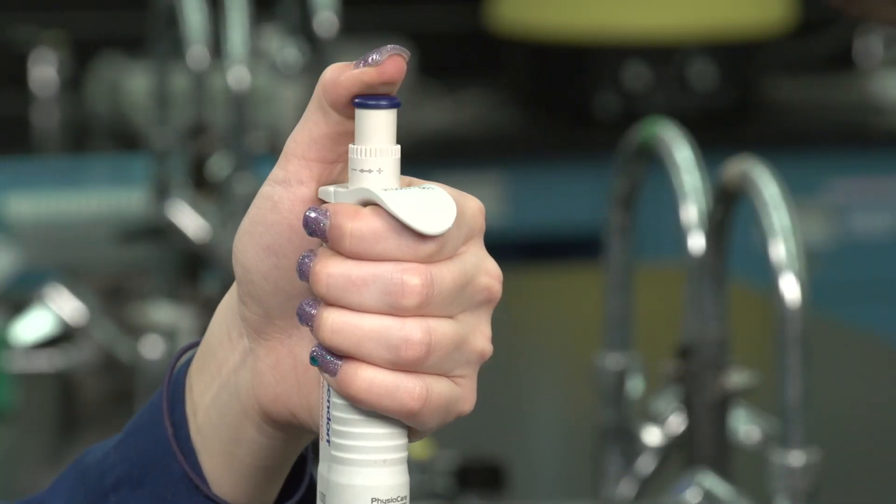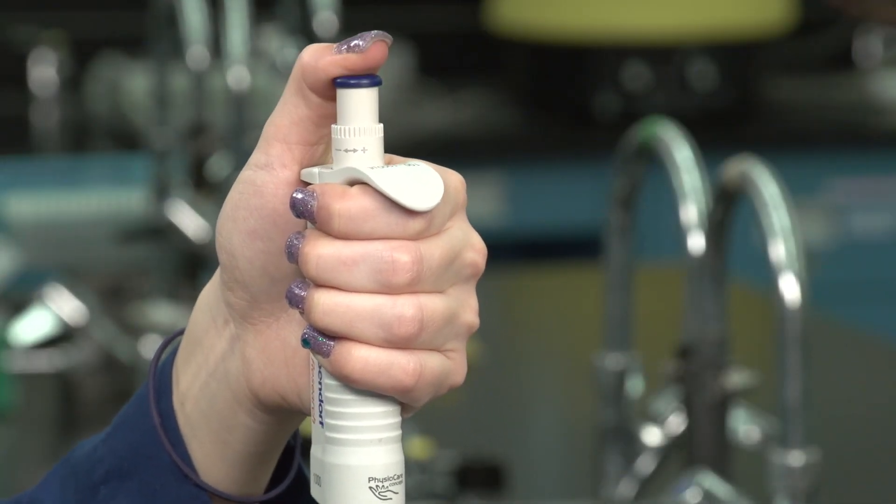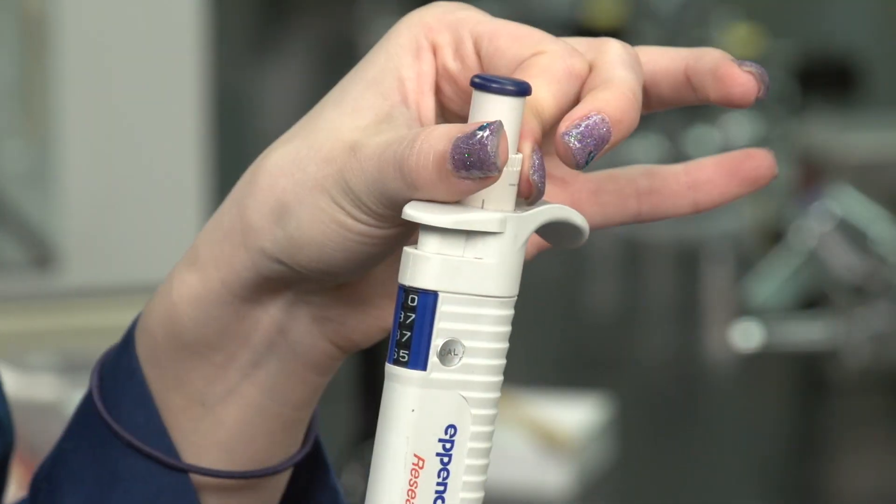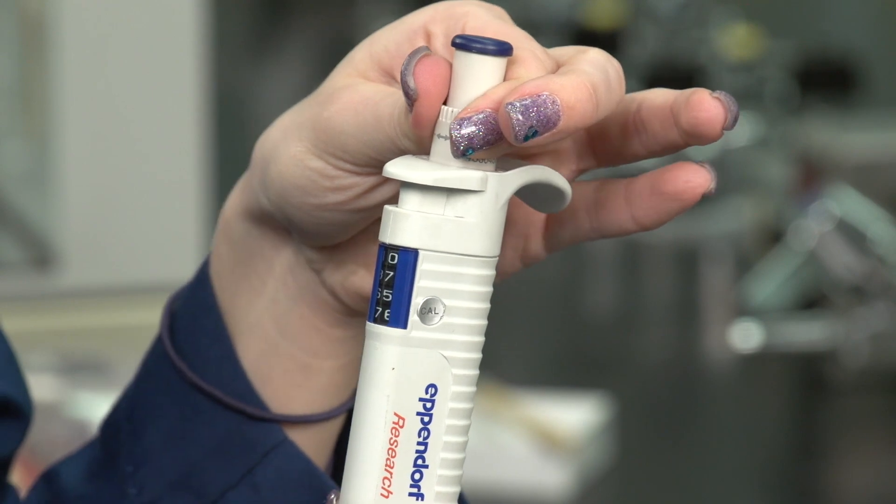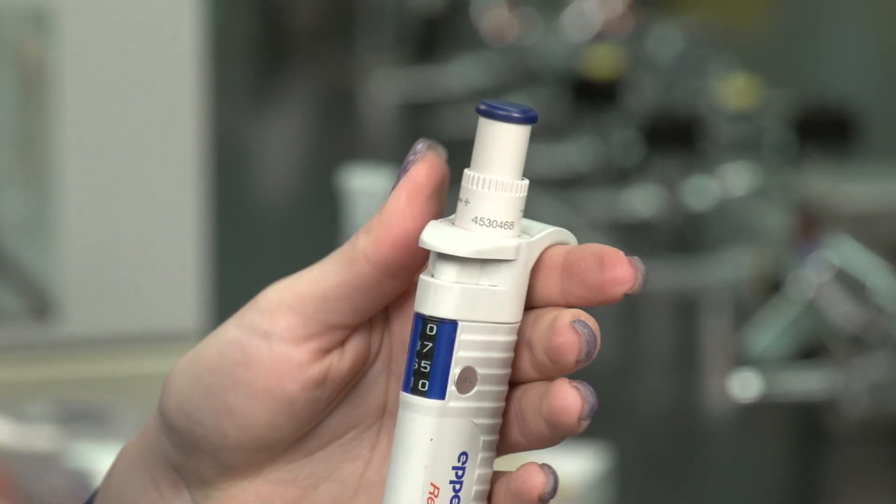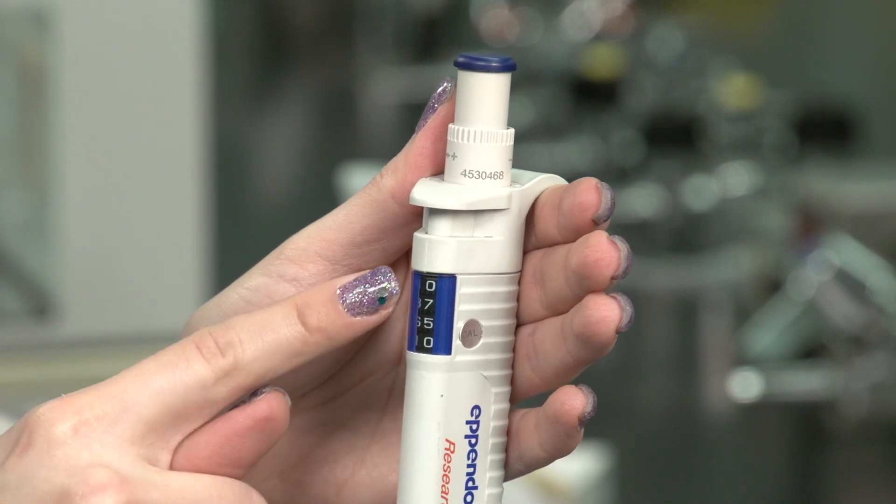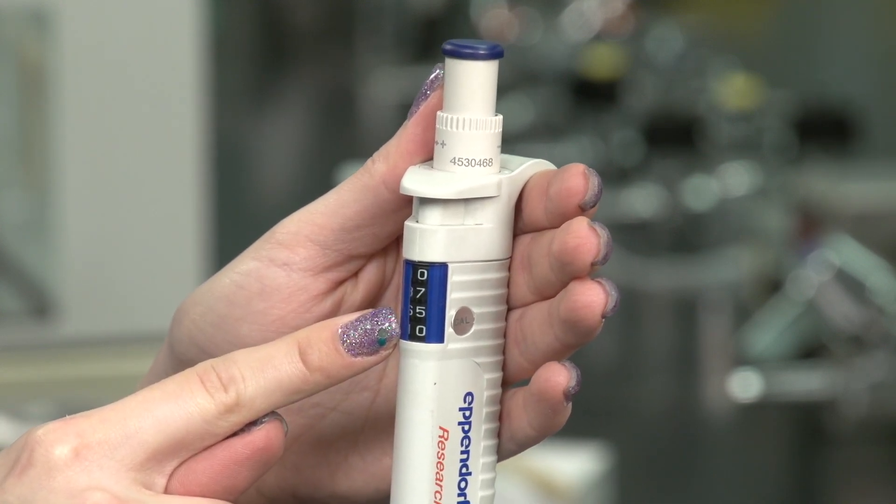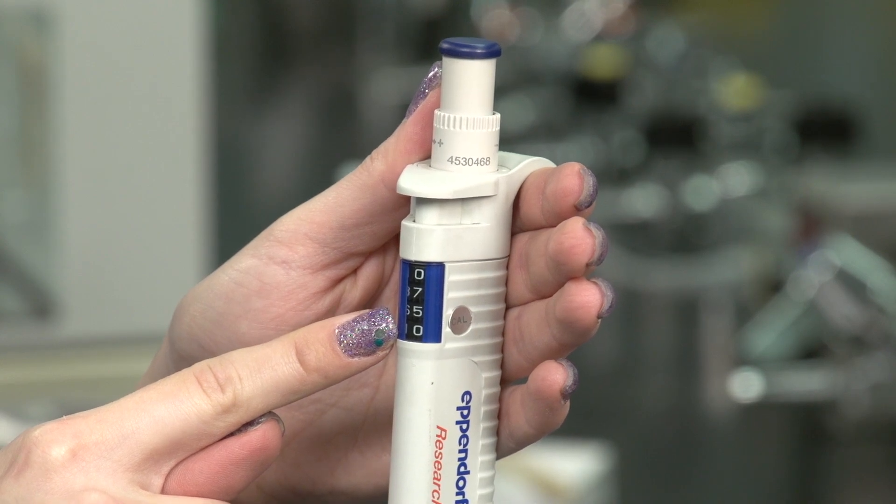Operate the plunger approximately 10 times to redistribute the lubricant and ensure smooth, positive action. To set the volume, rotate the setting ring to go above the desired volume, then return to the desired lower value. The figures in the digital display are read top to bottom. Never adjust the volume beyond 10 to 100 percent of the nominal volume.